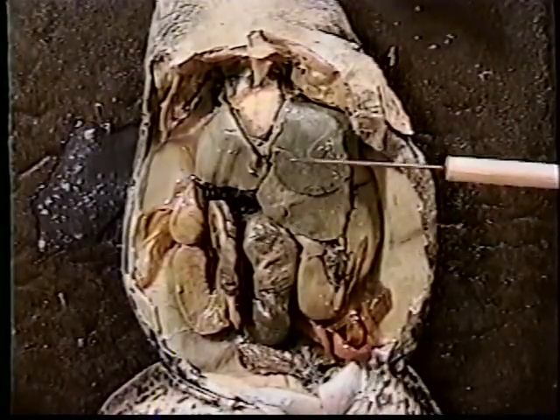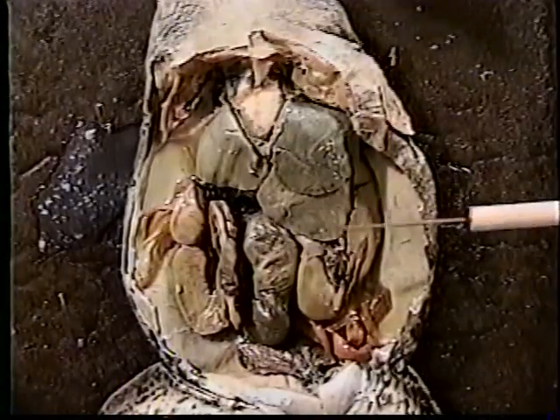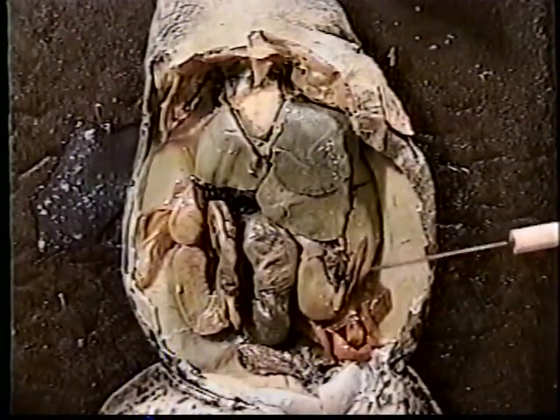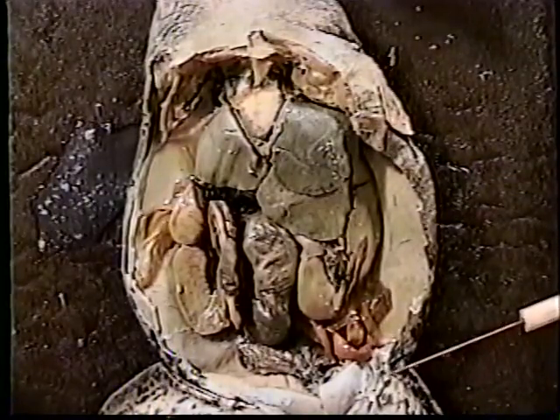In order to get a better view of the heart, we're definitely going to have to remove the livers. And while doing this, we will open one of them so you can get an internal view of what the inside of one of the livers looks like.